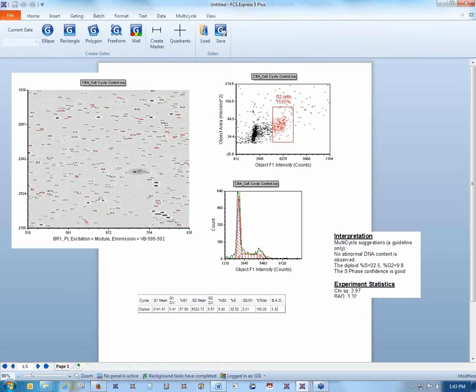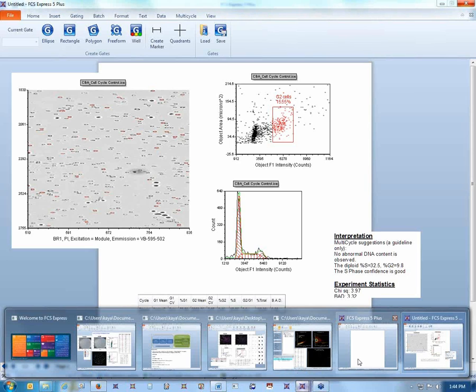So it's a lot of histological sections that were then stitched together after acquisition. And that's something that we can handle in FCS Express. Whether you're using Cell Profiler or ImageJ, both freeware, if you want to stitch a lot of images together, those two programs can do that, and we have the workflows for that on our website and in our tutorials, and then we can read that in FCS Express. So that should be opening up in a moment.